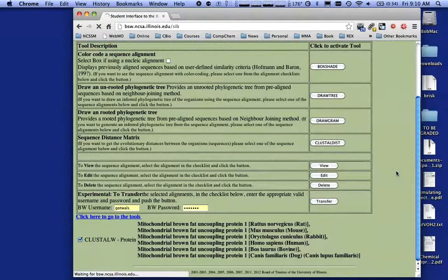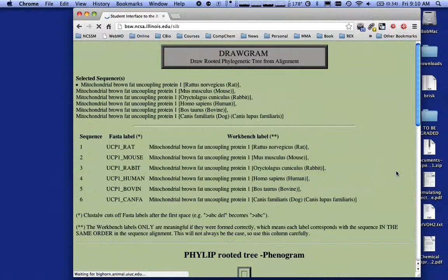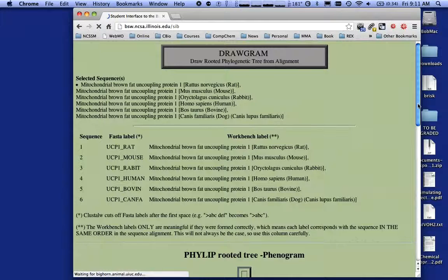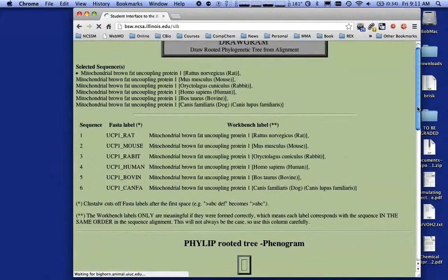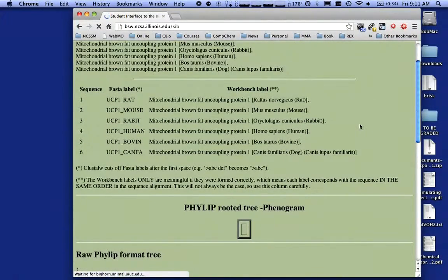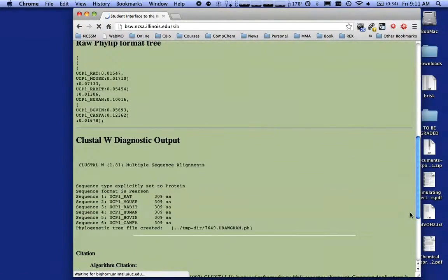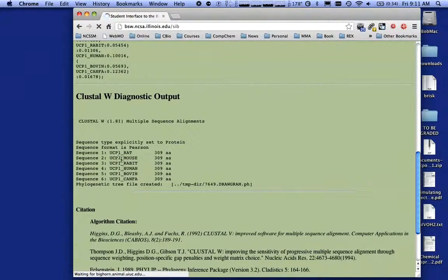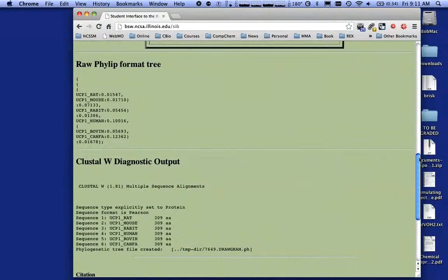This is the student version of the Biology Workbench. There's also a professional level at the San Diego Supercomputing Center. If you have an account on the student version in Illinois, you automatically have an account on the professional version in San Diego, and any studies you do will automatically be transferred. So all your research work is on San Diego as well. Our tree is going to appear in the phenogram box at the bottom. Notice that all six of my sequences for UCP1 all have the same number of amino acids — that gives me confidence I'm comparing apples to apples.